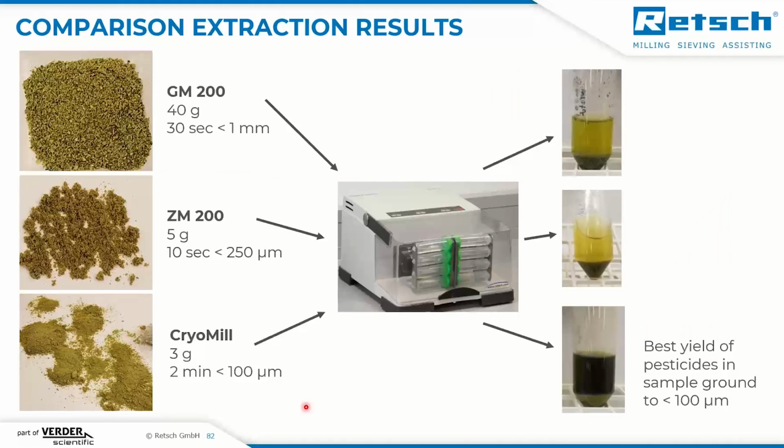And just as an example, we compare different qualities of plant sample, ground in the GM 200 to 1 millimeter, the ZM 200 to 250 microns, or in the CryoMill to 100 microns, and then do the QuEChERS method.